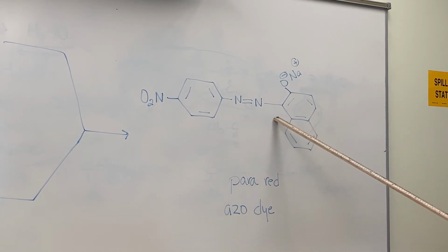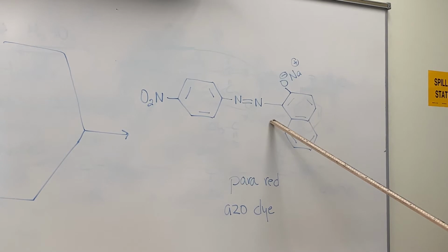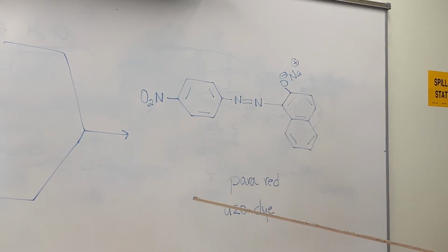There are certain classes of azo dyes that are called reactive dyes. They're used a lot in draperies and that type of textile. And if it's a reactive dye, there's a functional group that actually forms a covalent bond to the cellulose, and they usually have superior wash fastness. You'll probably see the dye stuff today doesn't have much wash fastness, especially when I rinse it, but there are some things you can do to improve that. That's beyond the scope of what we're doing today, but just to give you an idea of how you can make a dye stuff and how you can actually make the dye stuff on top of the fabric.